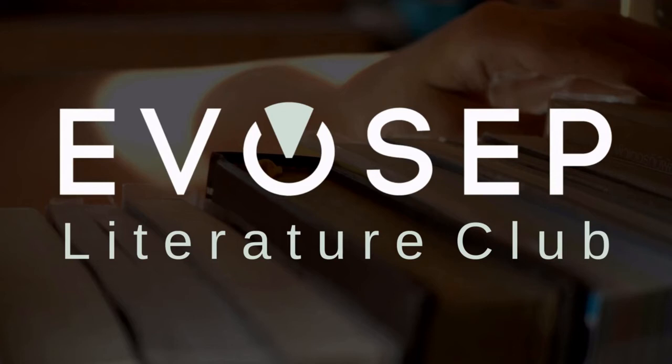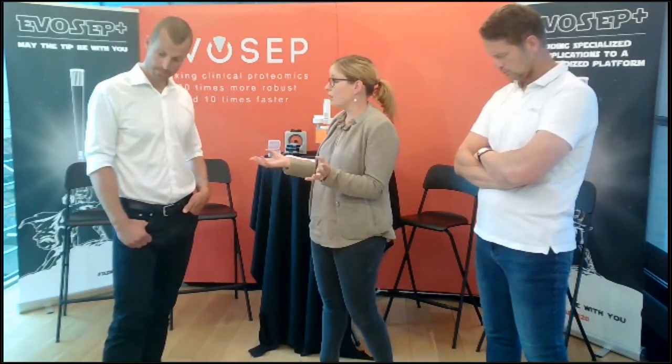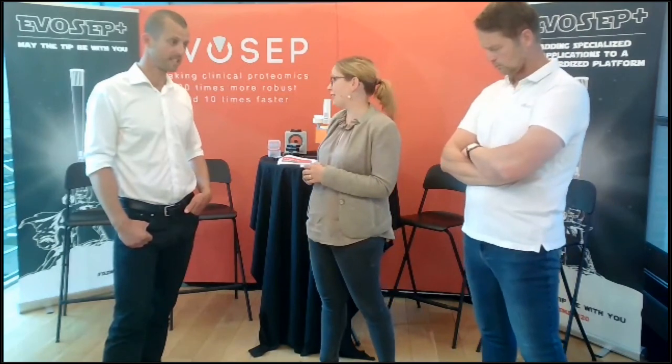I think what the video would show would be the latest Explorers launched last year, which they tested with the different standard methods and with very impressive data. But I think that might lead to the discussion of our standard methods and which method to choose. Yeah, with throughput versus proteome depth, because you cannot get it all. Not yet at least.